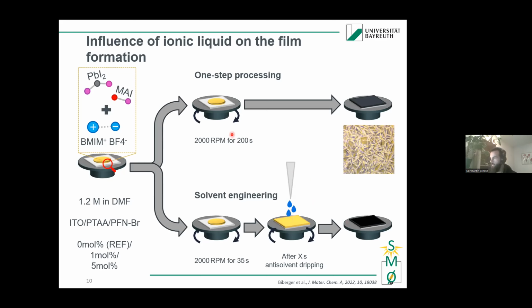So to know when we need to drop the anti-solvent, we need to know when the solvent complex phases form, so we first had to check whether the ionic liquid influences the formation of this solvent complex phase.